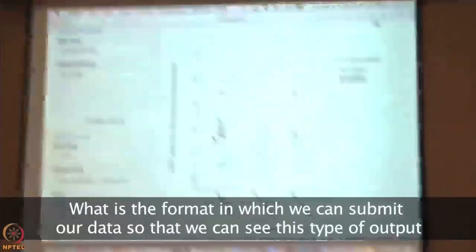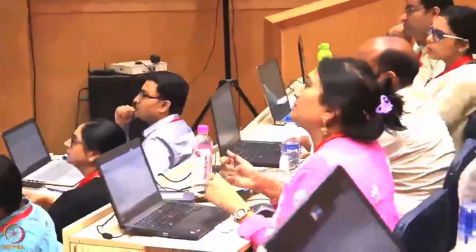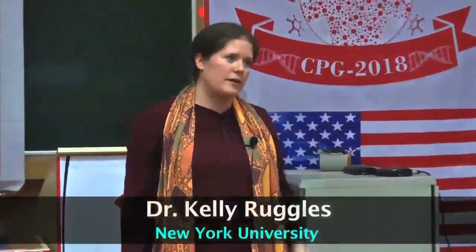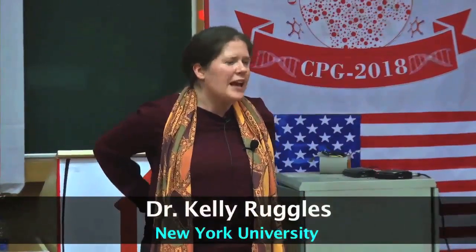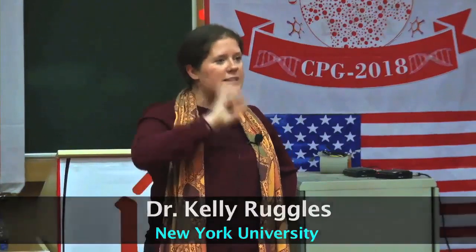Like in which format can we submit the data so we can get this kind of output? So yeah, I have to look and play around with it. I have all of the data I've ever needed. They've already put it on there for me, but I know that you can upload your own data. So I can look into that and then we can talk about it. Yeah, I know that you can. It's probably going to be expression level data, like VCF files, so really processed data, not raw data.